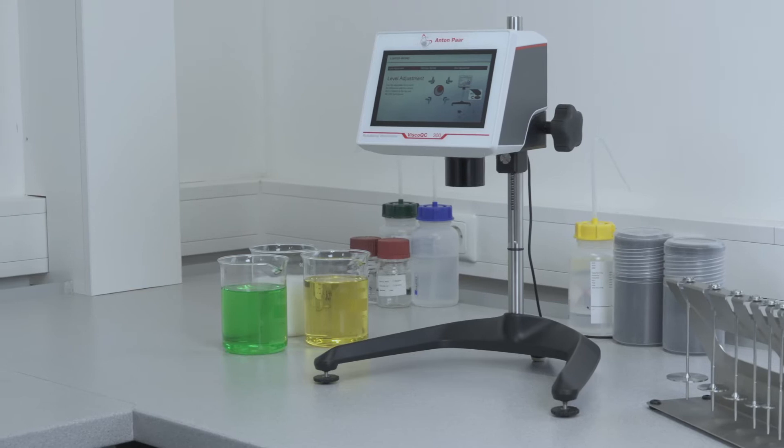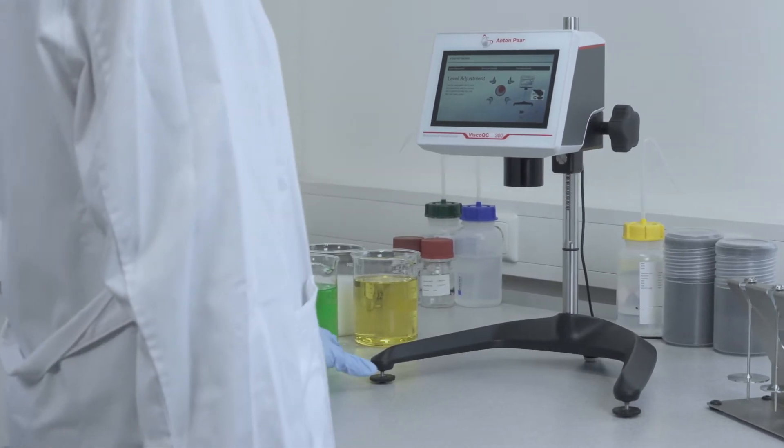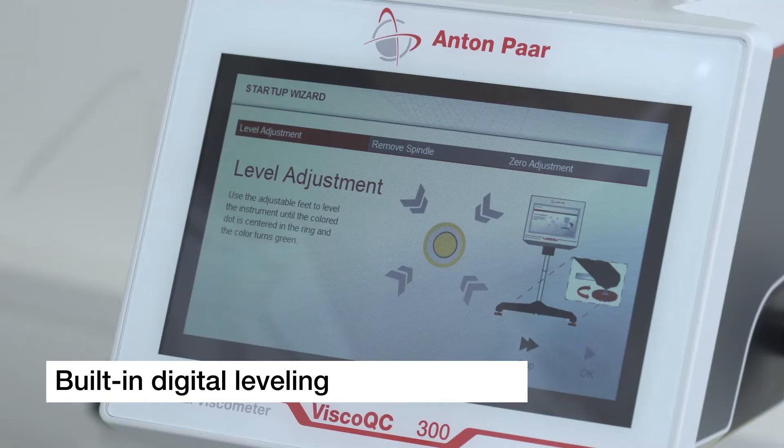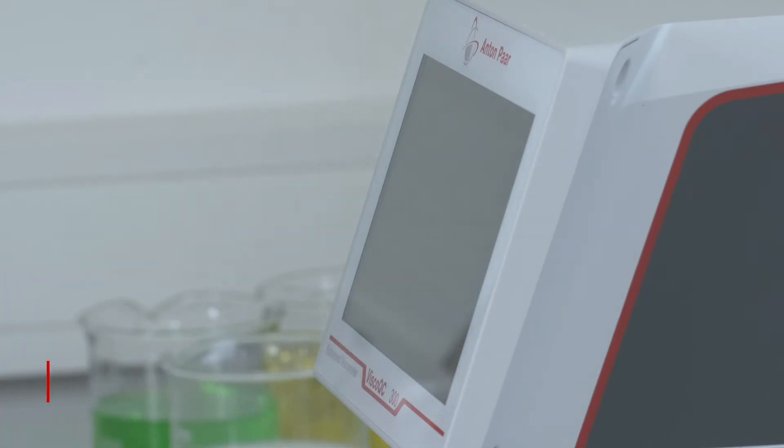Unpack and measure right away, as Visco QC 300 is already assembled when delivered. An intuitive alignment check ensures the correct instrument position at boot up and for each measurement.